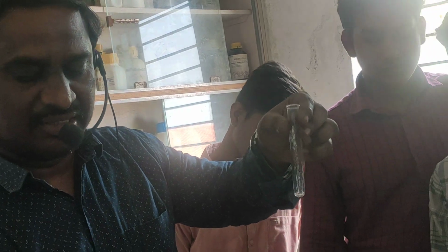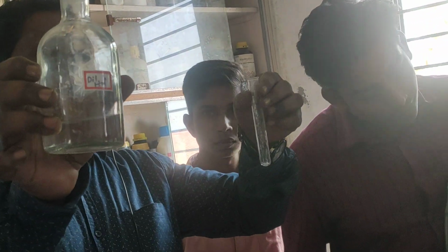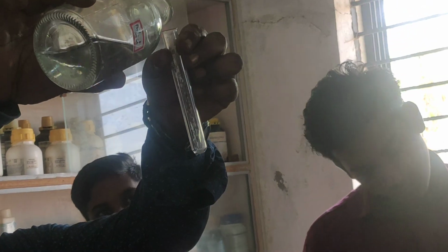You can observe here, this is dilute HCl. If you add dilute HCl, what happens? It gets dissolved. Just shake gently like this, and you can observe it clearly. Now it becomes soluble.